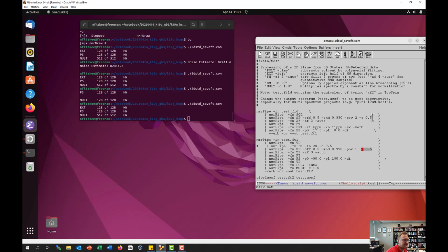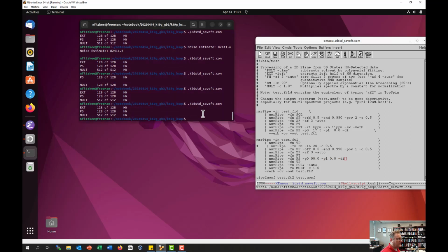And so again, that's really the only time you would need to change this dash C. And since we don't have 180 degree first order phasing in the nitrogen dimension, we're going to reset that back to what we started with. So now we should get back our... And again, I'll work with you to show you when that's needed or not.